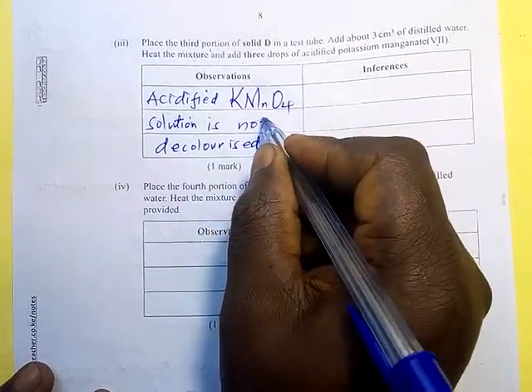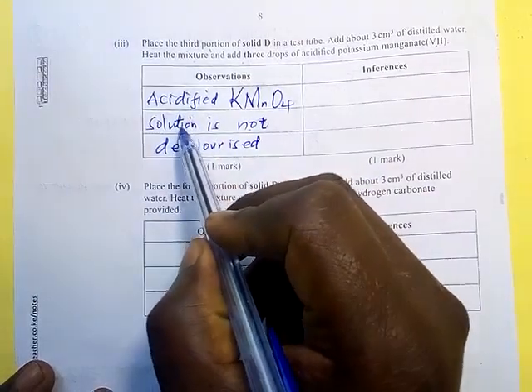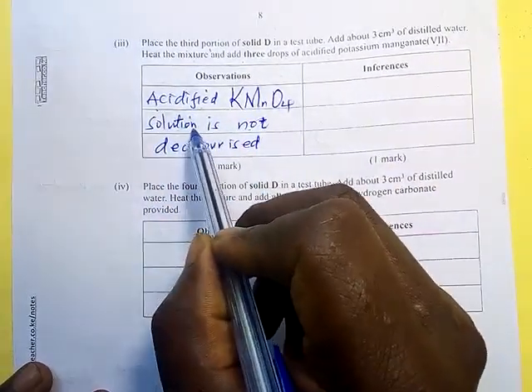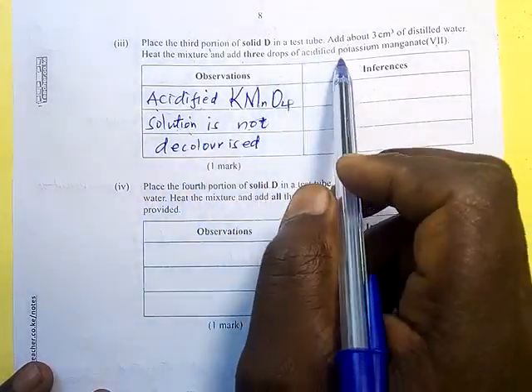We have reviewed that it did not decolorize. Another person can say the purple acidified potassium permanganate remains purple because it did not change.